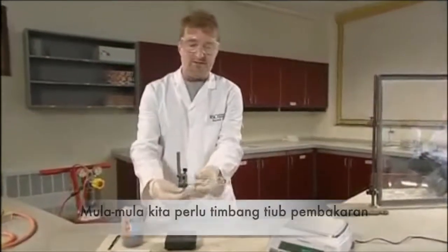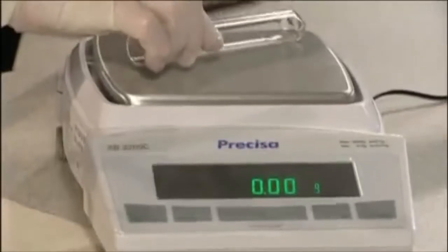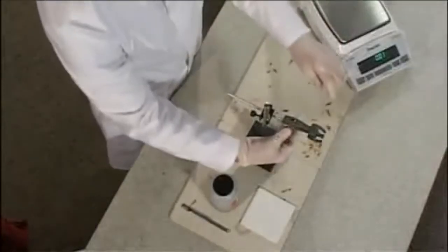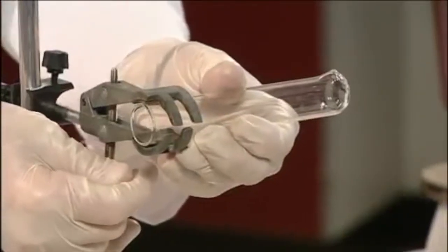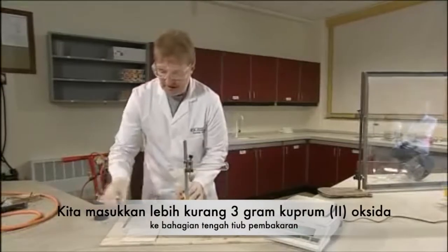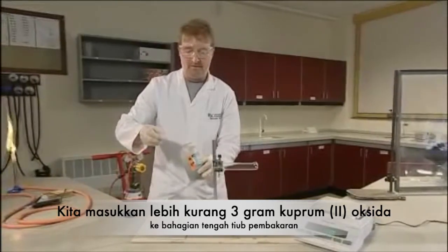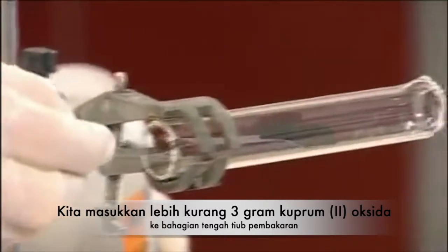We first need to weigh the empty reduction tube. The balance used must read to at least 2 decimal places. We now place about 3 grams of copper oxide, which is really a couple of spatulafuls of the powder, into the reduction tube.